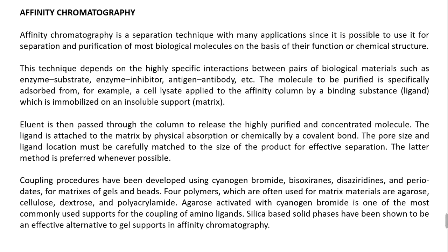Unfortunately, the preparation of affinity chromatography media, that means affinity resins, is a little expensive. So you have to find a methodology and attach the molecule that is going to interact with your protein of interest to the resin, either directly, or with a carbon arm, to facilitate the binding process and make it a little flexible. So this method is very important, at the same time a little complex when compared to any other type of chromatography. And affinity chromatography is a separation technique.